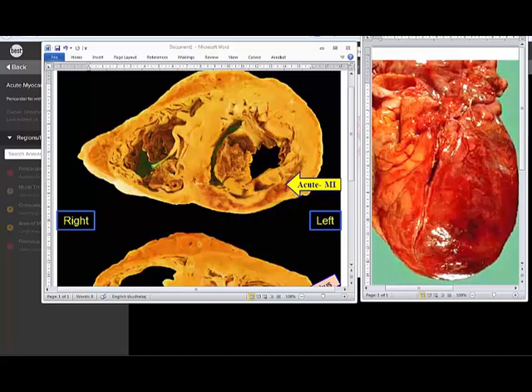I am trying to demonstrate the microscopy of myocardial infarction. Before that, we will just go through briefly the gross specimen. Of course, you would have seen a patient with chest pain due to coronary block.